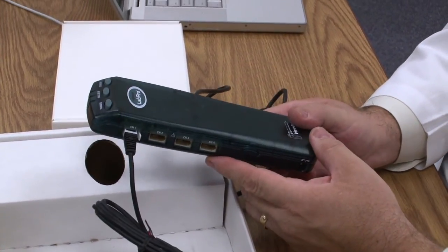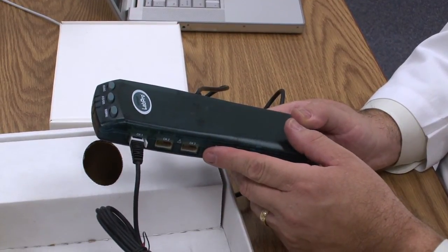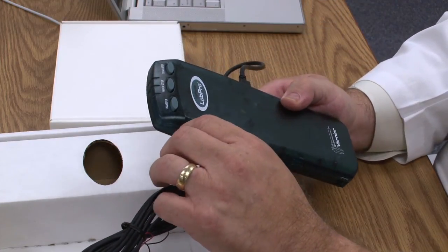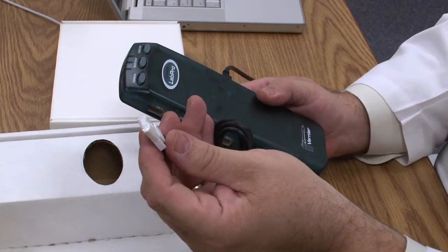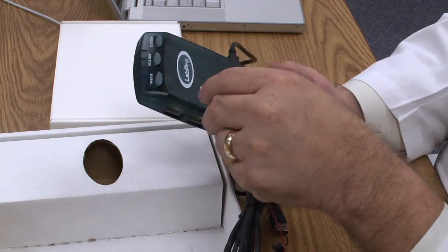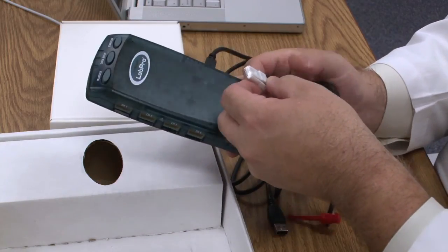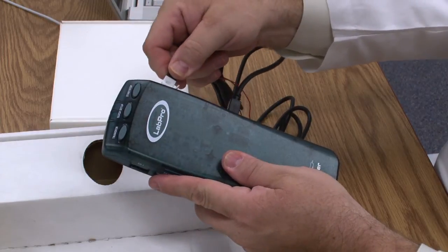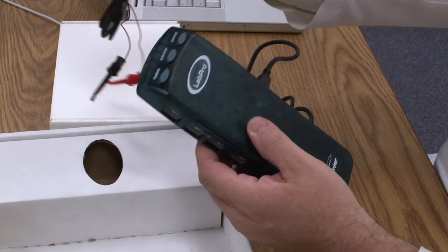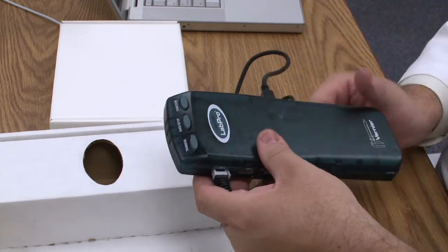There are two kinds of probes with the LabPro: analog probes that go into the left-hand side, and digital probes that go into the right-hand side. You might ask how you know if a probe is analog or digital. Vernier is very smart about this — a probe will only fit on its correct side. If I try to plug it in on the wrong side, even though the plugs look very similar, they are not identical and it will not fit. So if it won't fit on one side, turn it around and it fits on the other.